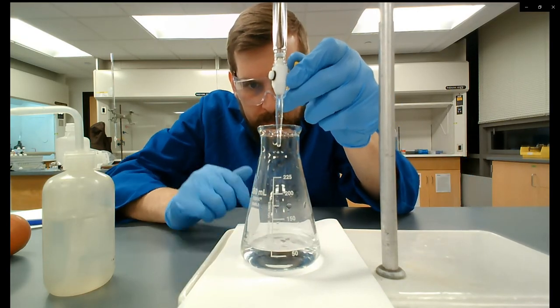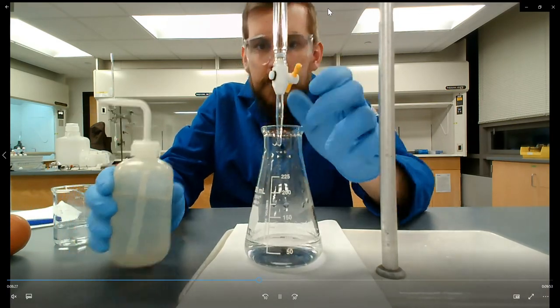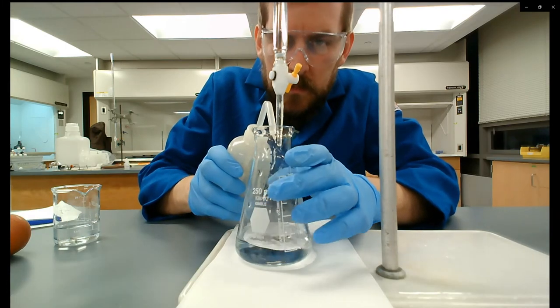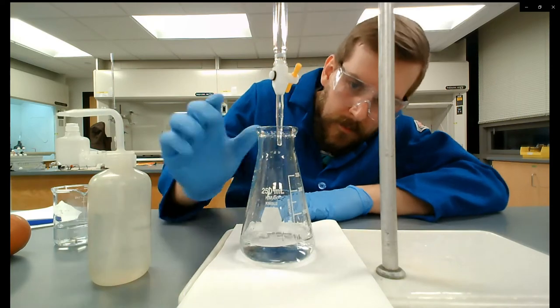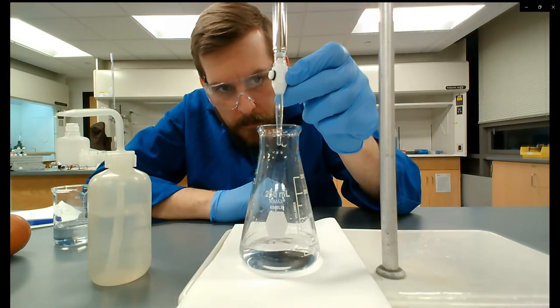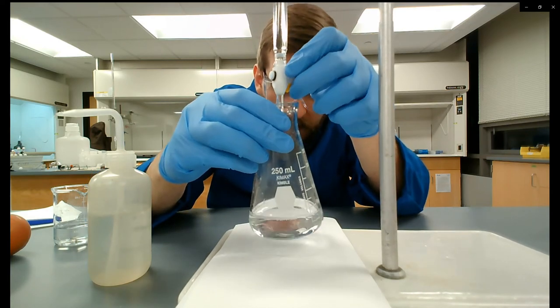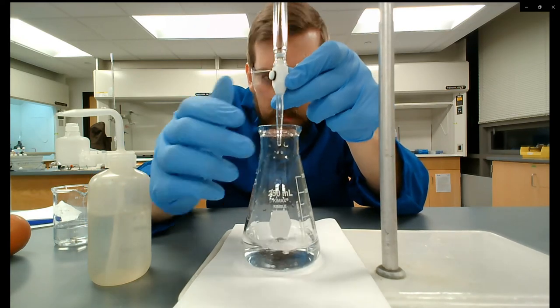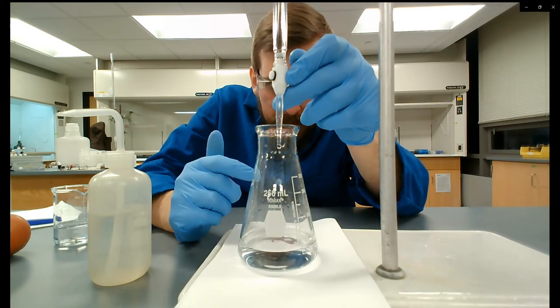The rest of this video is just me doing these four vinegar-sodium hydroxide — acetic acid-sodium hydroxide — titrations. The technique is the same. If you want to keep watching feel free, but at this point it's repetition, so if not, you're good to go.